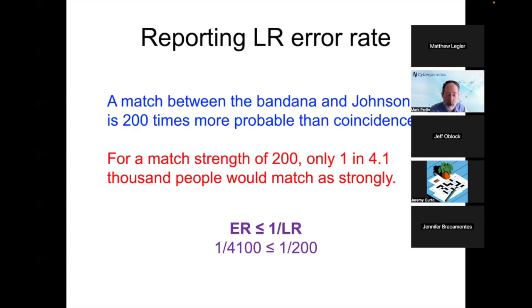This is useful in court if you have a large match statistic or any match statistic, and somebody asks about error rates. You can always say that an upper bound on the error rate is 1 over whatever your match statistic was, and that's always true. Okay. Continue.